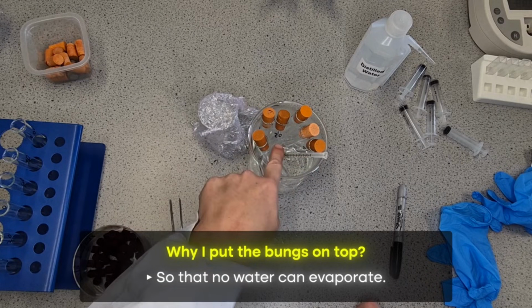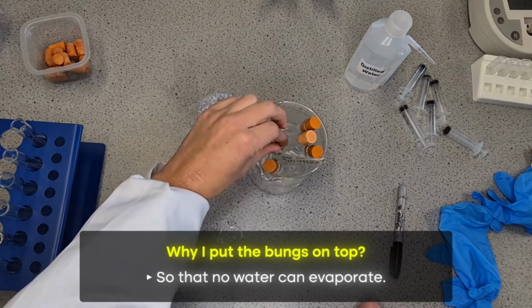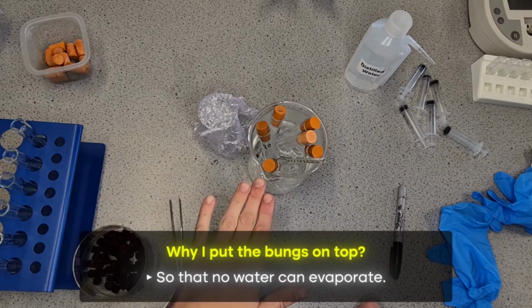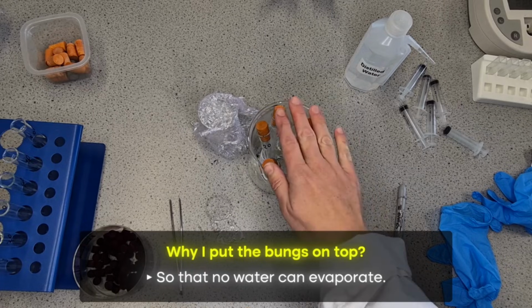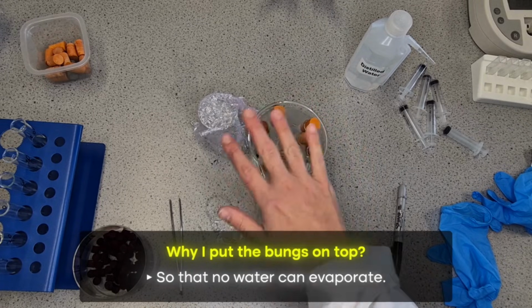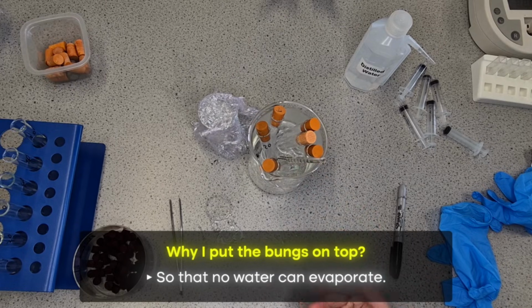So what we thought originally was, let's say we've got here 20%. If water is evaporating out of that throughout the whole experiment, we now don't actually have 20%, it might be 25% instead. So that's why we keep bungs on. It's so that no water can evaporate, so that the concentration inside there is the concentration the students are expecting that they have.